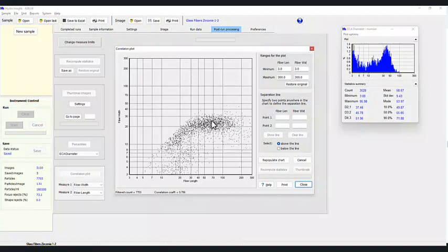It looks like there are a large percentage of particles that are of a specific width. So the width seems to be very controlled, but the length is a bit all over the place, all the way from the 30s to 200 in some cases. But then there are some smaller particles, and I believe those smaller particles are chunks or little small pieces.